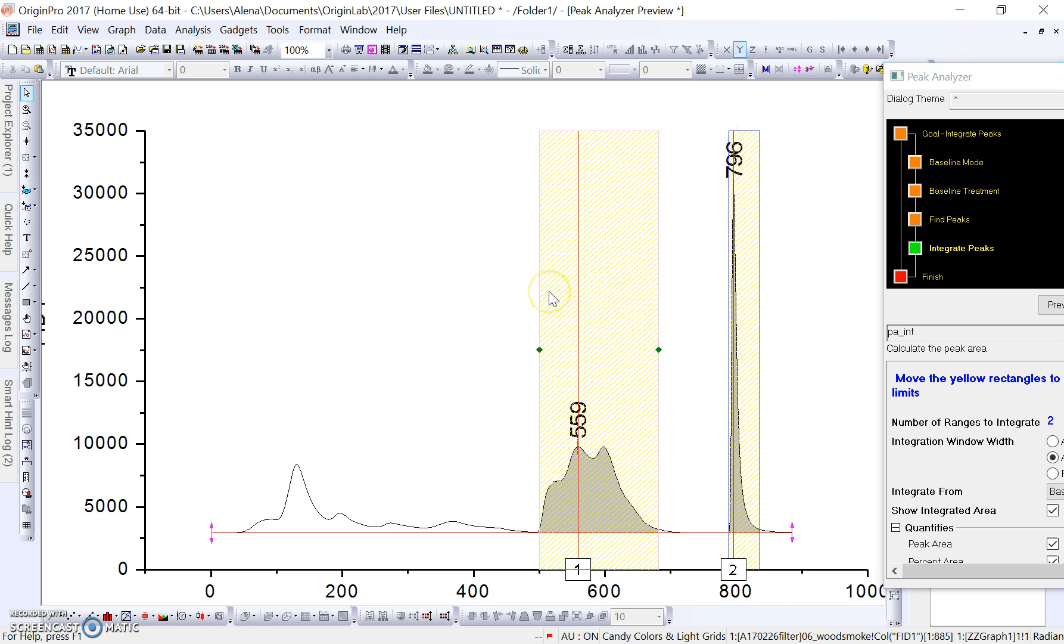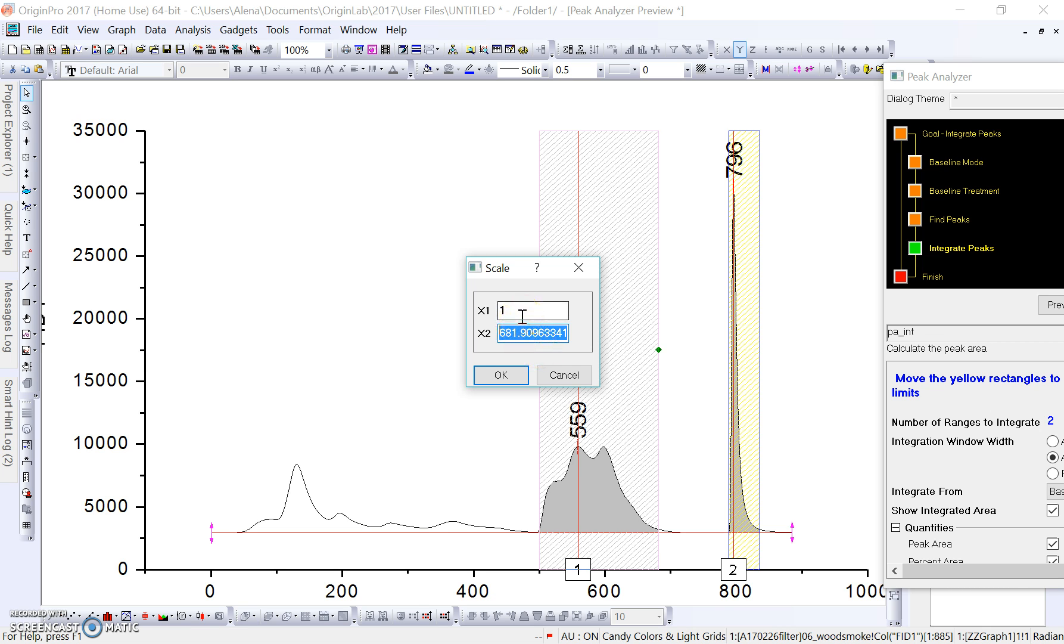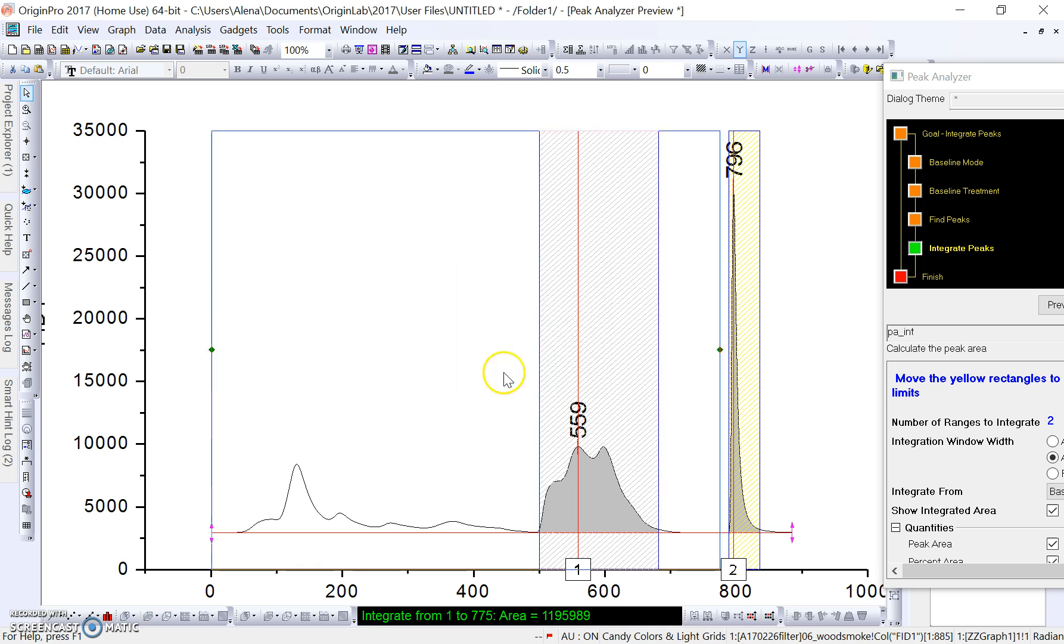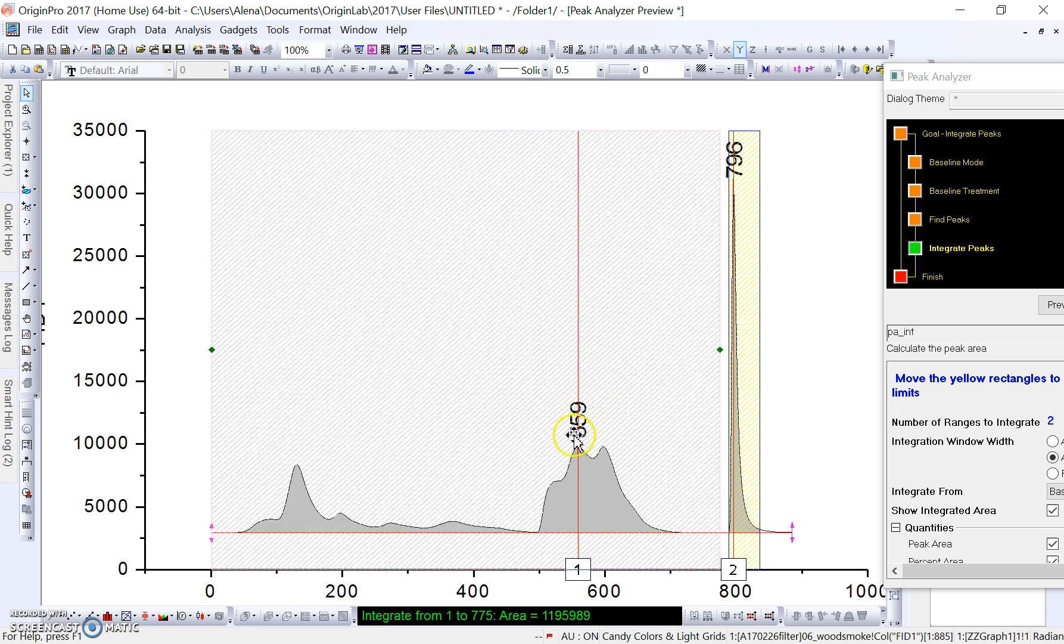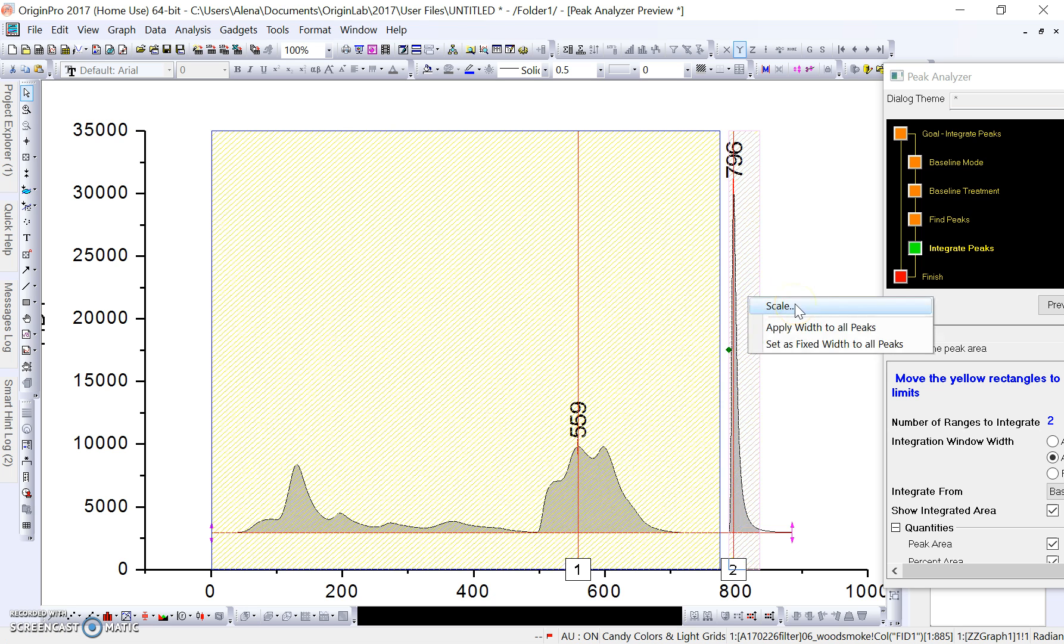What we can do is right-click on this and click Scale. We can actually set this to any value we want. The x1 value in this case is seconds. I'm going to set it to 1 for x1 because we start our analysis at one second, and then set the second one to 775 because that is the end of the collection of our sample in this case.